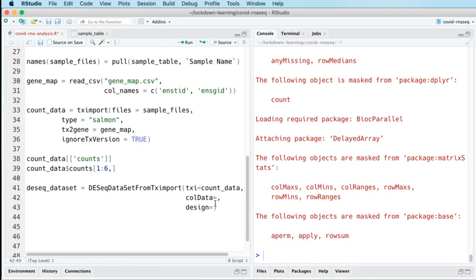Sorry, I'm seeing a bit of chatter in the comments, which I'm just going to pause and talk a little bit to the people in the comments. So, configuration failed for package XML. That's an interesting one, which I could solve on Linux really easily because it means libxml is missing on Linux, but I don't know how to solve it on, I presume, Windows.